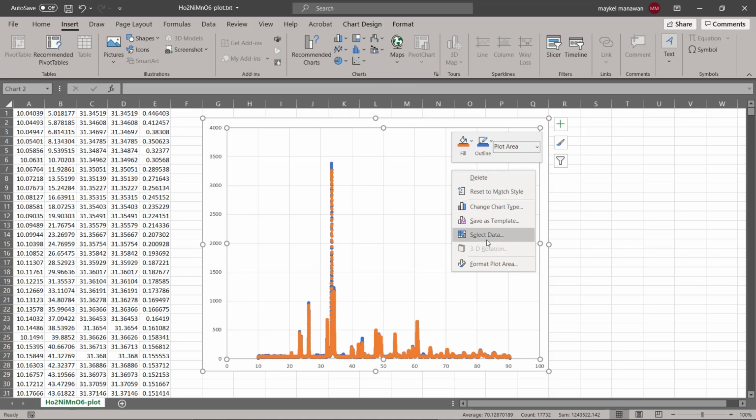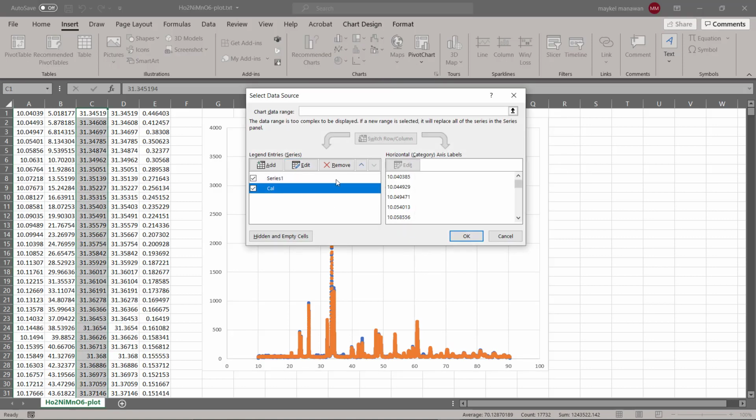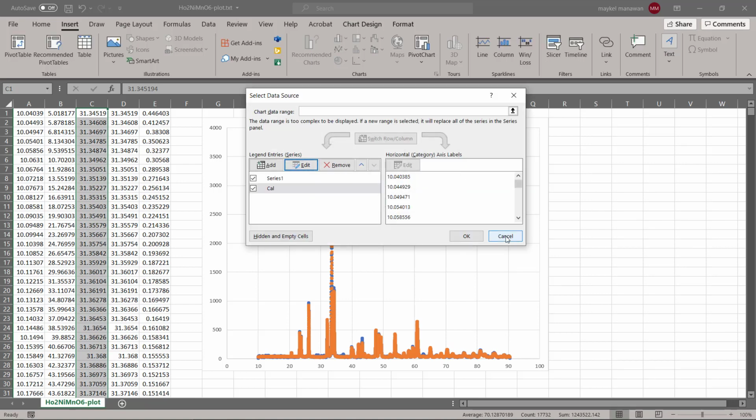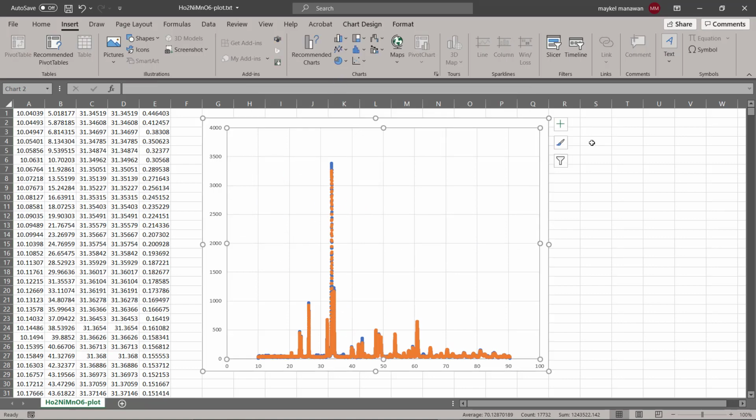Probably. Let's check. Can I change to edit? No. I don't know how to edit it. But anyway, you got the idea.